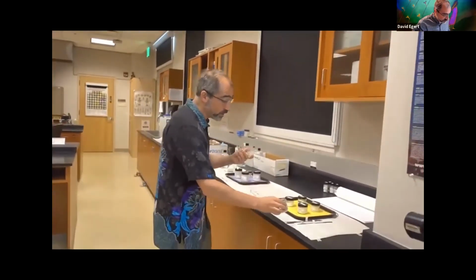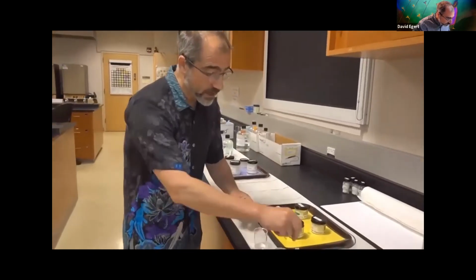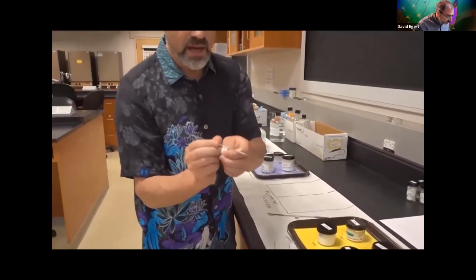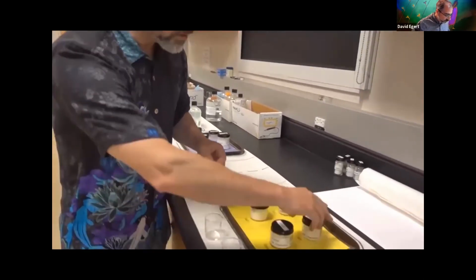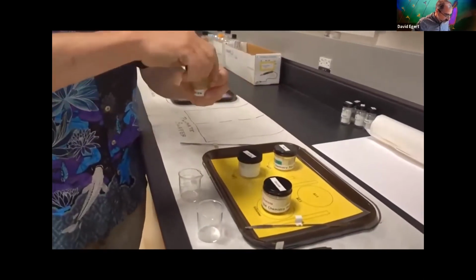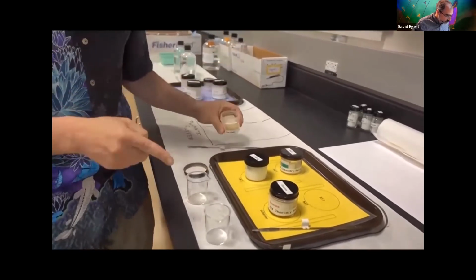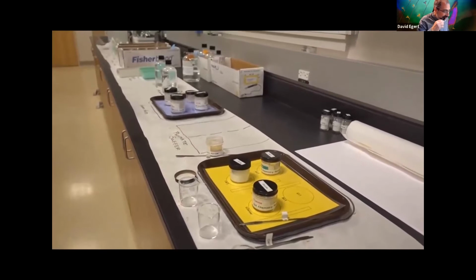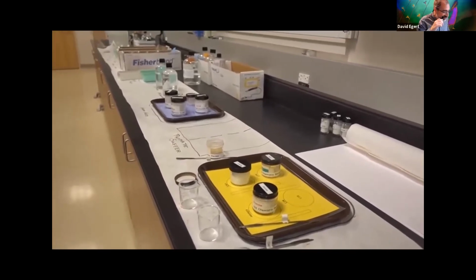We can come over here, and each of these spatulas is labeled so I don't cross-contaminate between the different things. I also want to make sure I mark what these are.